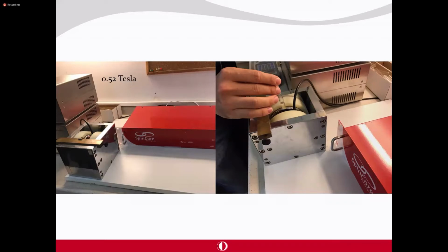And this system, at its optimum temperature, is operating at 0.52 Tesla, which corresponds to a proton frequency of 22.4 megahertz. So you see the frequency is quite low compared to these high resolution systems that we talk about.